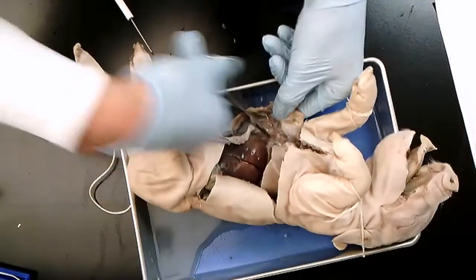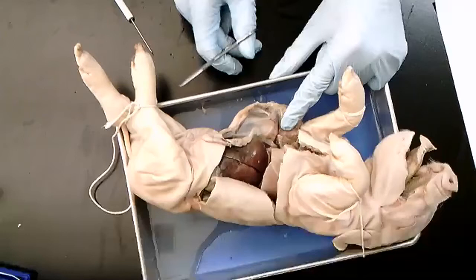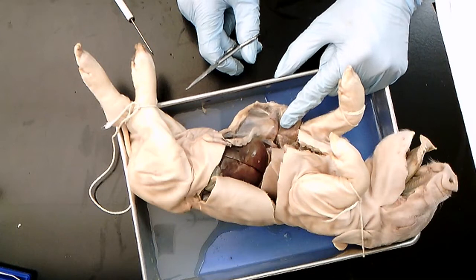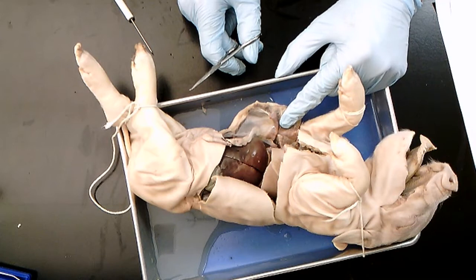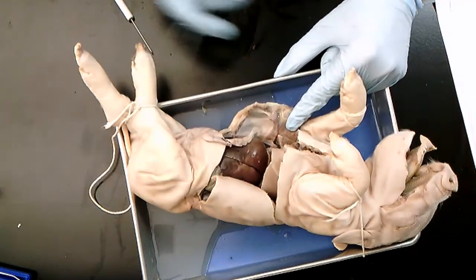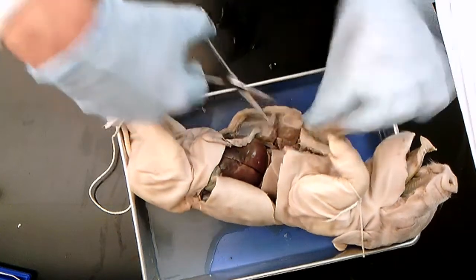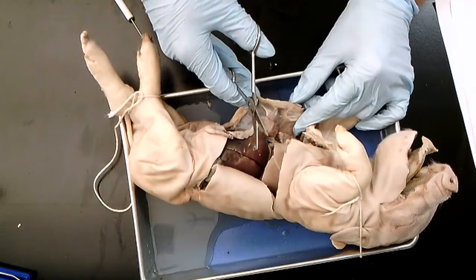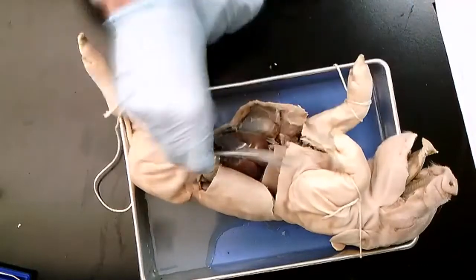Will they have most of the hour to complete this whole thing? They will. They'll get about 45 minutes. We need about that last 15 minutes for cleanup and to get everything set up for the next group. The 45 minutes, with the dissection, identification, and the few questions, I think is ample time for the students to do this. It does not take as long as you think once they've done it several times. Yeah. If it's the first time dissecting the fetal pig, it's going to take longer, but hopefully everyone has done it prior to the event.